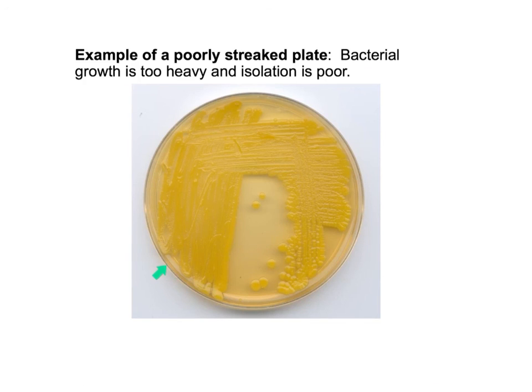This right here would be an example of a poorly streaked plate because the bacteria growth is so heavy that we really don't have any isolation, maybe a little bit here and here, but not a lot of isolation of individual bacterial colonies.